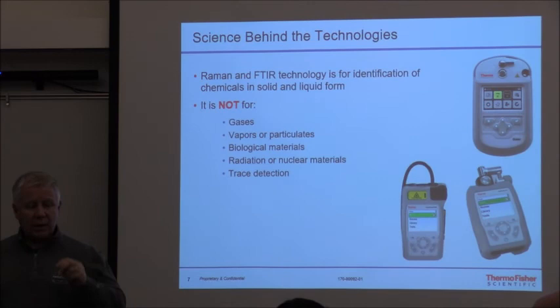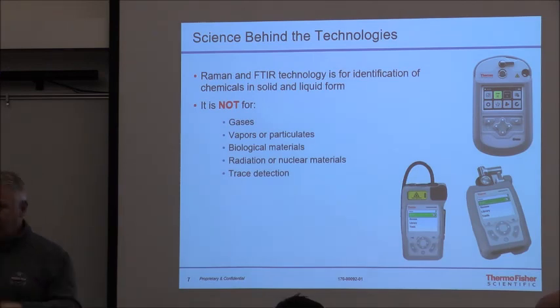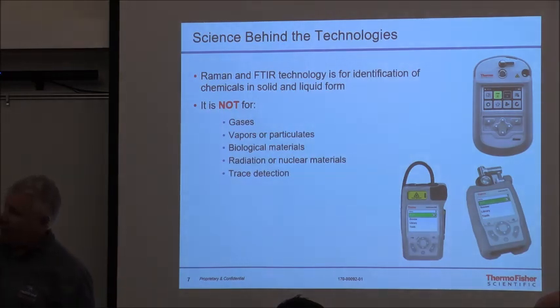So I have to be cognizant of taking multiple collections from multiple points when I run the sample in order to get an actual fit. Okay? So keep that in mind when you run a sample here. Just because the instrument says one thing doesn't mean it's only one thing. If I shoot right up through here, if I try to take a sample and I only get the orange crystals, and my device says, hey, you have chemical A, and I stop, I'm like, okay, I found chemical A.